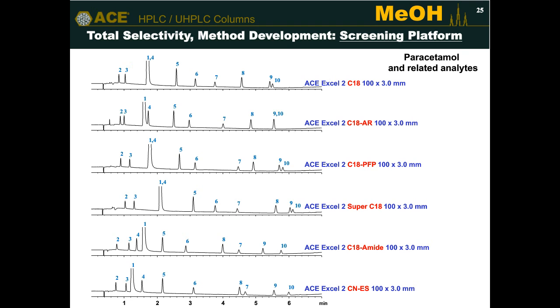So if you don't have MS, which many labs don't, and I didn't for many years, we use peak area to try and track our peaks across different chromatograms. But in an ideal world, you would use UV absorption spectra if you have diode array detection, but ideally you use LC UV-MS, UV and MS in series. You build a picture around the UV data, the absorption spectrum, the peak area, and of course the MS data. That's always helpful, because then you can track your peaks as they move around the chromatogram depending on the different conditions you're using.